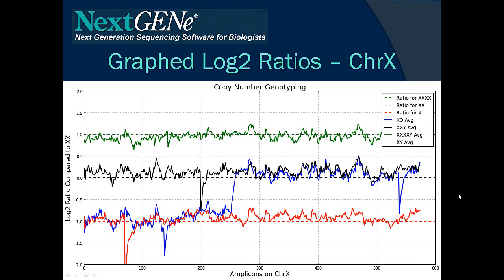Here we can see the results for chromosome X. The control sample that all of these replicates were compared to was a female sample, so anything with a ratio near 0 would be an XX genotype, a ratio near negative 1 would be an X genotype, and a ratio near 1 would be a 4X genotype. The XXY genotype sample, as expected, has a ratio near 0. The male XY sample has a ratio near negative 1, since there's only one X chromosome. The 4X sample has a ratio near 1, because there's 2 times the coverage of the control sample for the X chromosome.